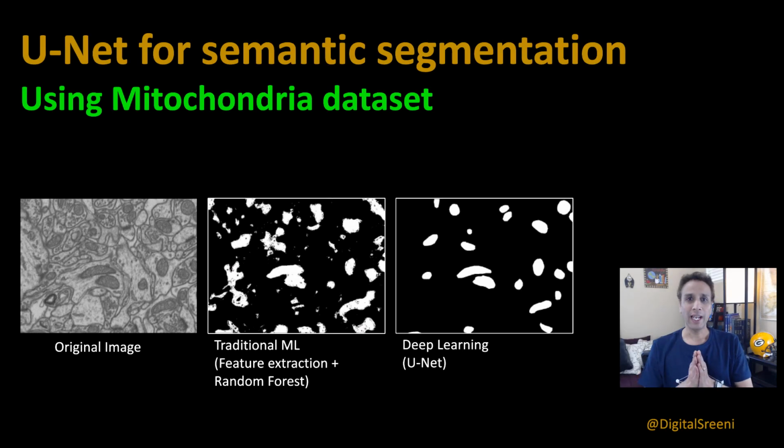Hey guys, this is Srini, and in today's video, let's talk about using UNet for semantic segmentation. And let's use the mitochondria dataset that's publicly available. I'll leave a link for you guys to practice this.